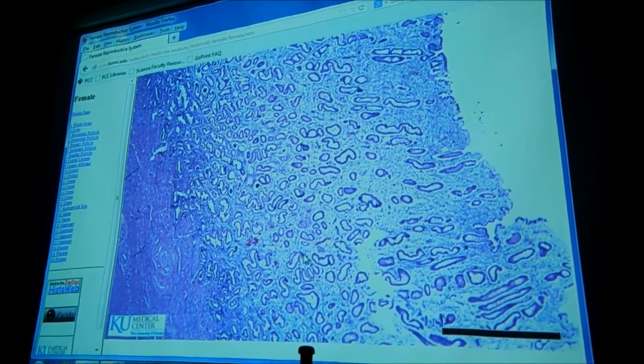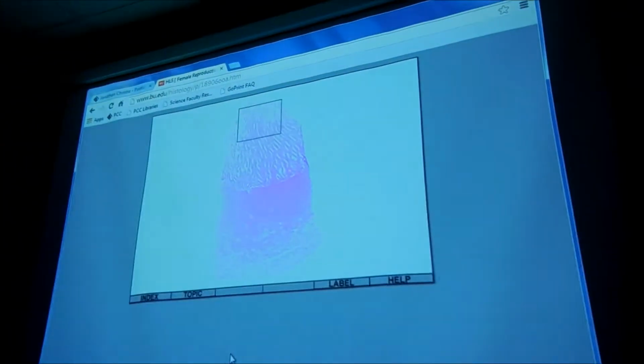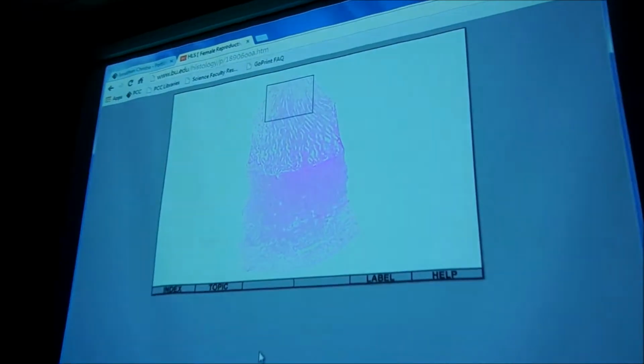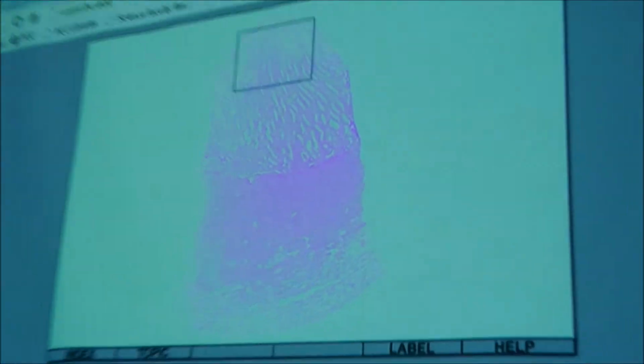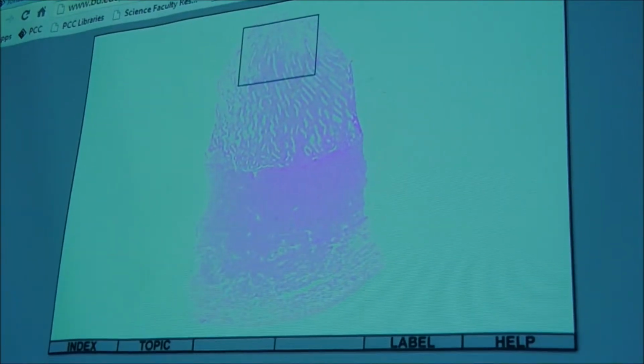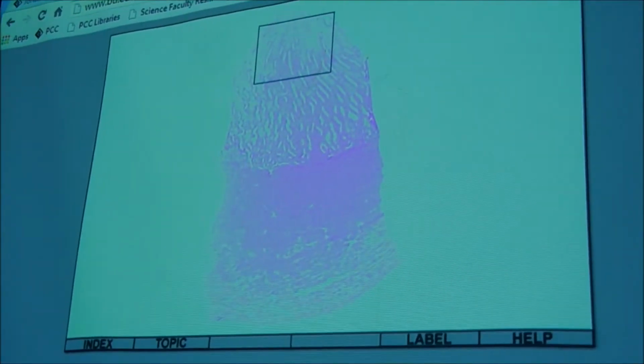Okay. So then, let me show you this picture here. This is from far away, but you can see the uterine glands up there. So what phase do you think that is? If they're straight and long. Proliferative. Proliferative, you're growing. So proliferative phase, straight and long.